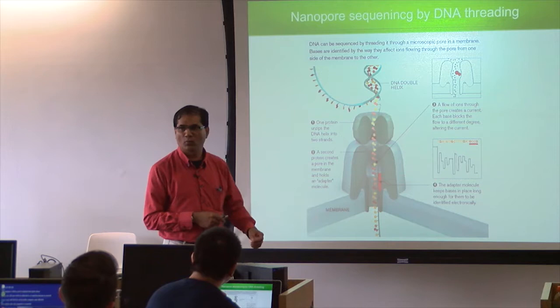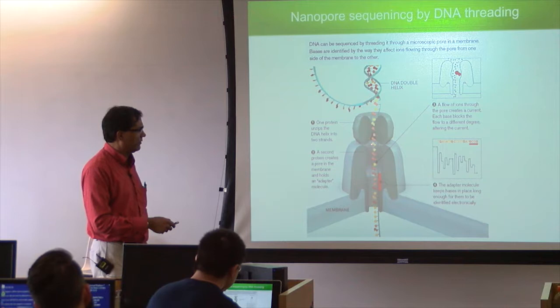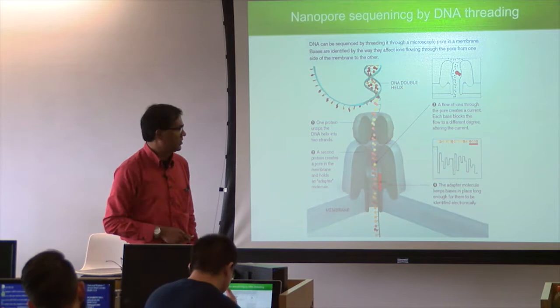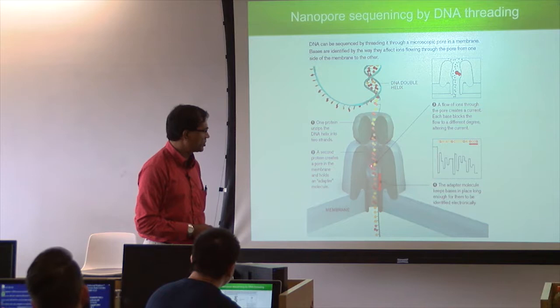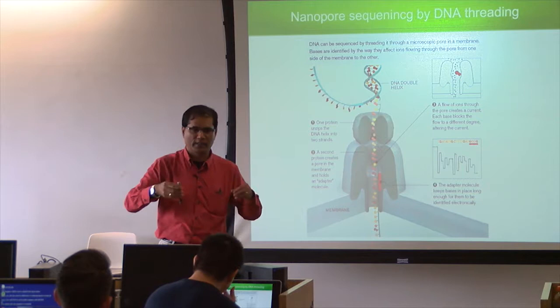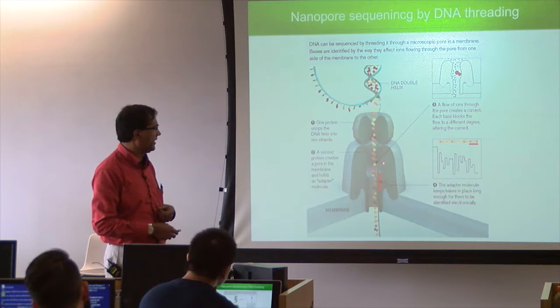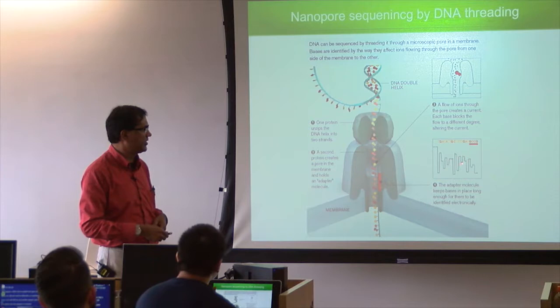So when we do this, what is important is that, when we are pushing this, somewhere along, we have to again slow down the movement of this one molecule. So they created some kind of a mutation, the chemical modifications here, where it slows down the movement of the strand in this region. When it slows down, you get a time. The pattern of that electric flow persists for some amount of time so that you can record that. Okay? So if you make it slower, then when it passes through, you can detect these changes in the signal.